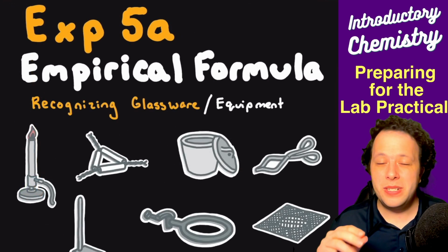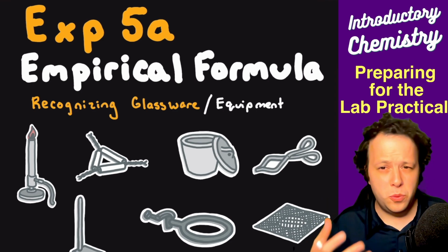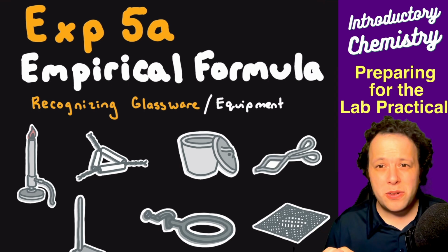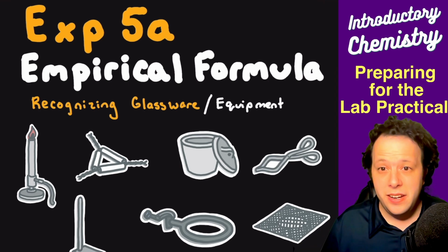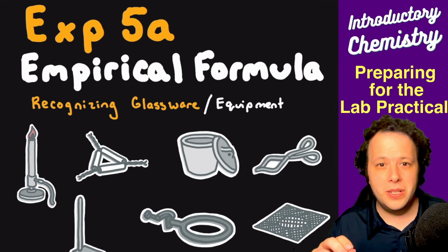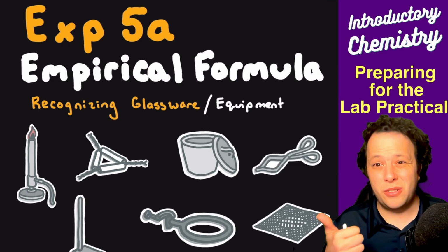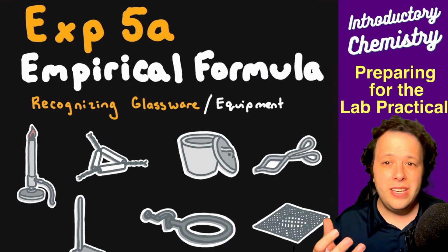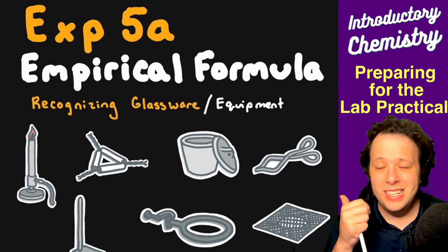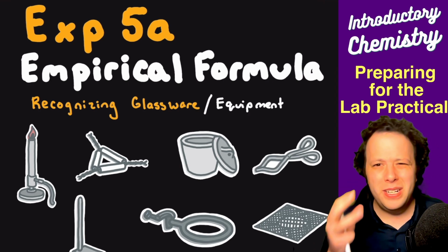Experiment 5A was the empirical formula lab, which was probably one of your first more difficult workup labs because it tied in the concept of the mole, empirical formulas, molecular formulas, and a ton of new equipment. It was kind of like your first real chemistry experiment. So the first very common question that could come out of this one is recognizing your glassware and equipment. Generally on the first page of your lab manual after the table of contents is a list of what all the equipment looked like. They're drawings, not the best pictures, but it's something to study from.